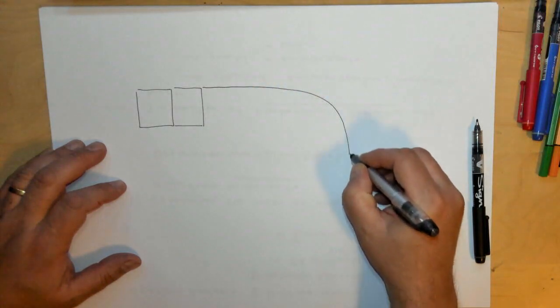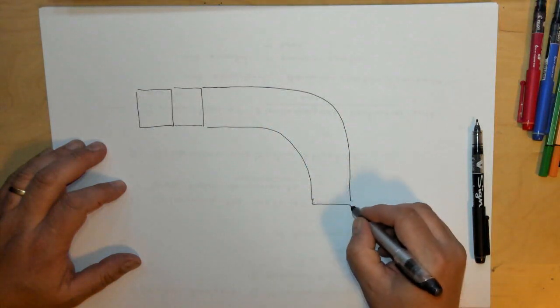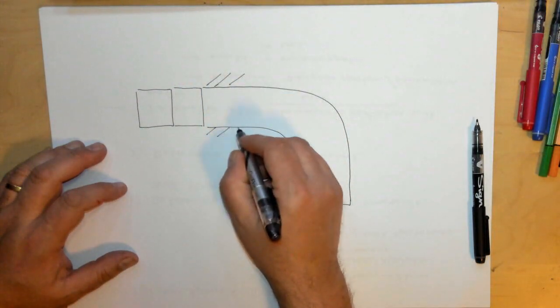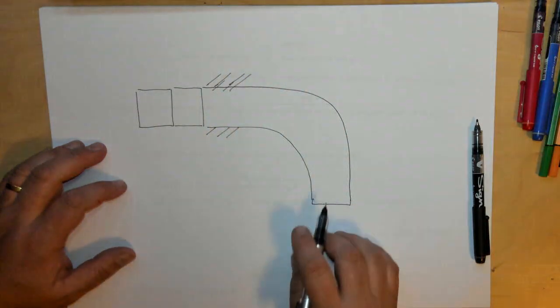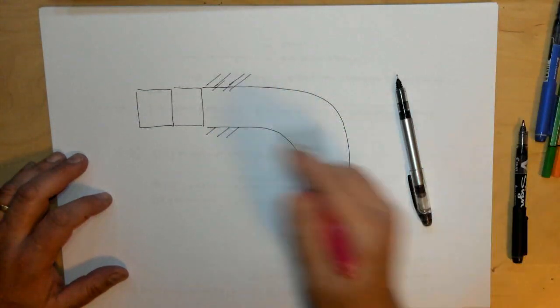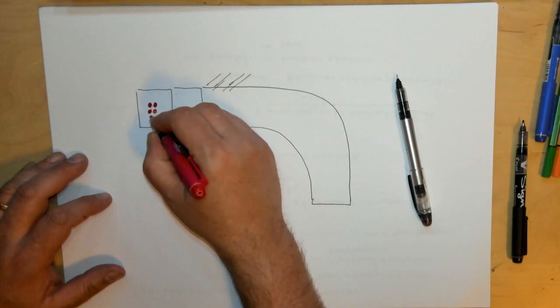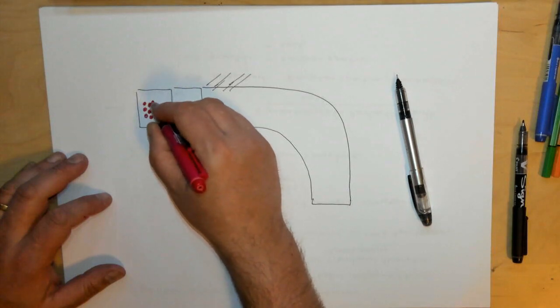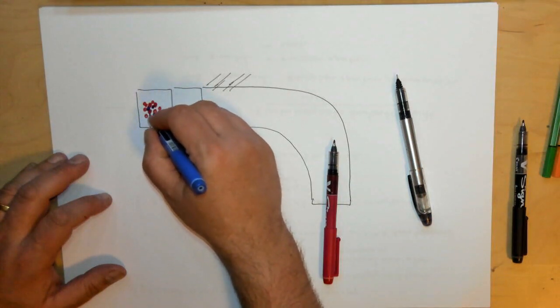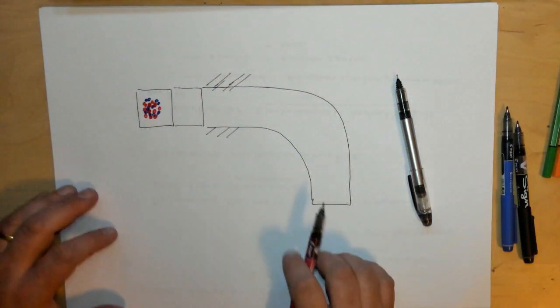And so what you have is a long tube that has a bend in it. And these can be made out of different materials, glass or some other thing. And basically what is happening is that you enter a sample into your machine here. Let's say I have a sample that's composed of two different parts, or it can be two different atoms, or it can be a sample with two different molecules in it. You can do all sorts of weird things with these, but basically here we have a sample that's composed of these two things.